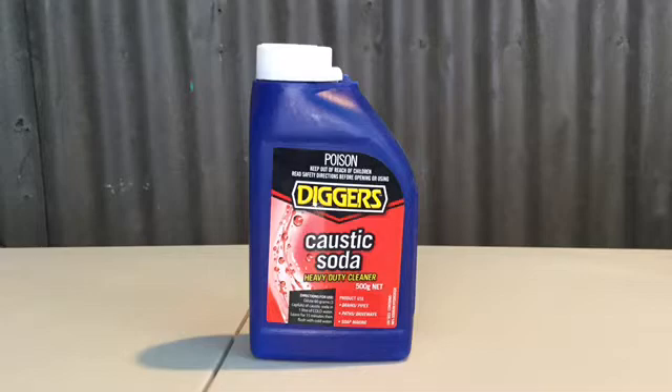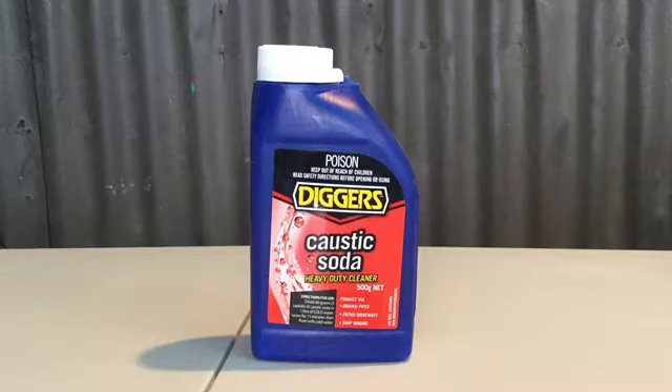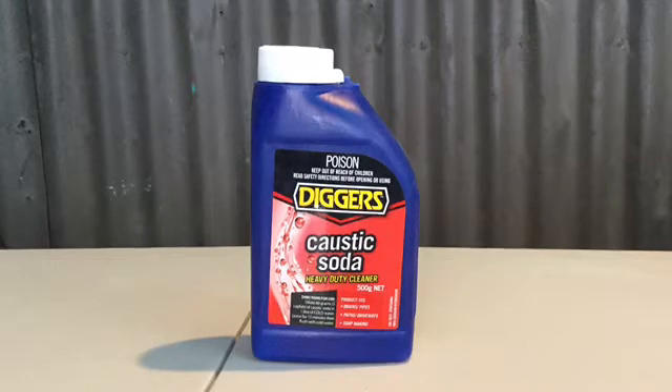The objective was to recrystallize sodium hydroxide. This Digger's brand Caustic Soda was used, which was purchased from a local hardware shop. It is usually used for unblocking drains. However, it contained 98% sodium hydroxide on the side label, which is still very pure. However, it can cause miscalculations sometimes when making solutions, and a higher purity was desired.